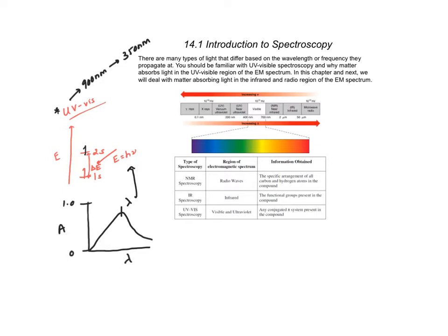So that was the basics. We had a nice little absorbance plot, or absorbance spectrum. We're looking at absorbance as a function of wavelength, and this is usually in terms of nanometers. If we get a peak, that tells us that at that wavelength, this light had an energy that was directly equal to the energy spacing between the orbitals, and so we got absorbance.